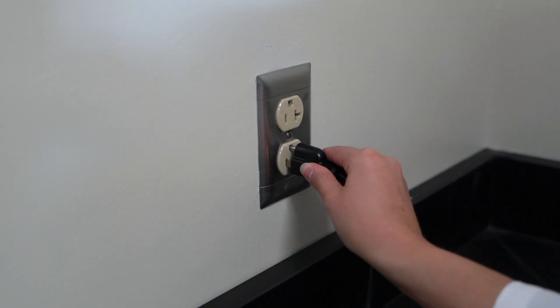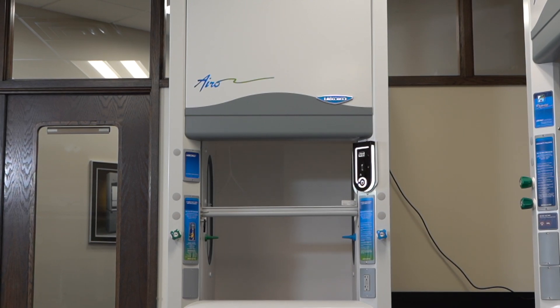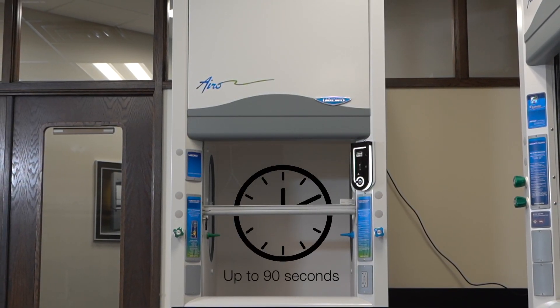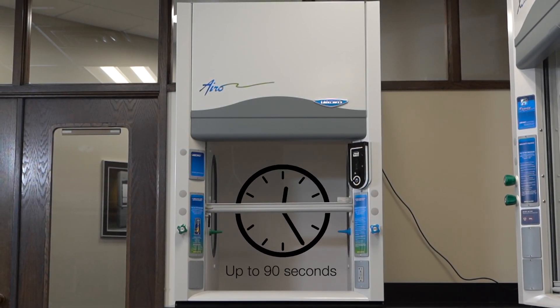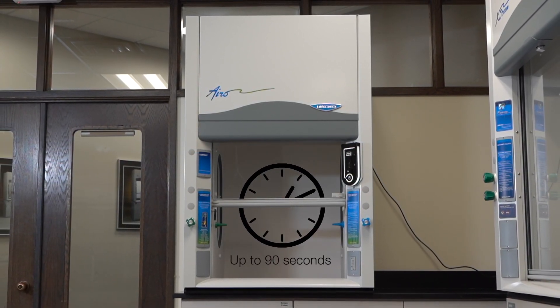Now connect your filtered fume hood to power and turn it on. The turn-on sequence may take up to 90 seconds. The panel will have a delayed light-up, and then chime to signal when the startup sequence is complete.